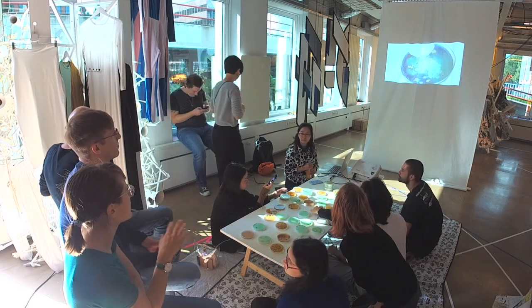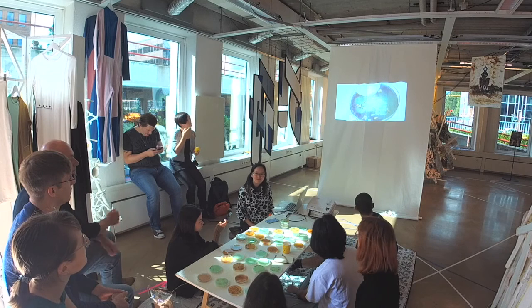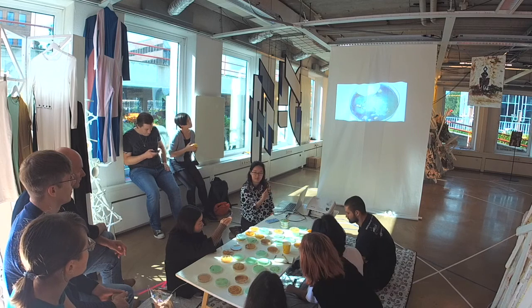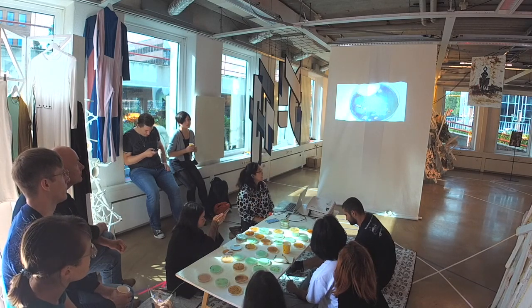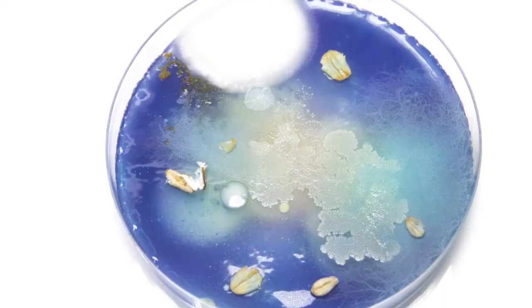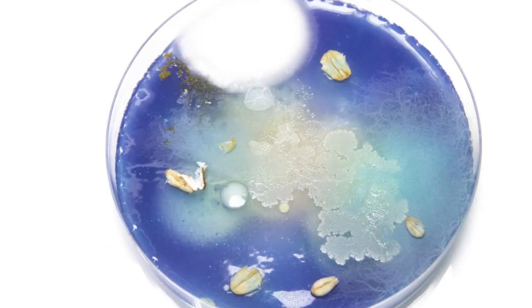Why is the culture blue? Did you just dye it to see better? I put the colors in there because this was one of the messy experiments I was trying to do. I was trying to find the right formula for one of my projects, which I'm going to show in a bit. So I was trying to see if I can use the colors to show more characteristics of the bacteria. What you can see is that the purple-ish thing is a mix of red and blue. So here it is only blue. And if you refer to the beginning of the video, see? It was all purplish, and then in the end it becomes more blue because the red is being digested.